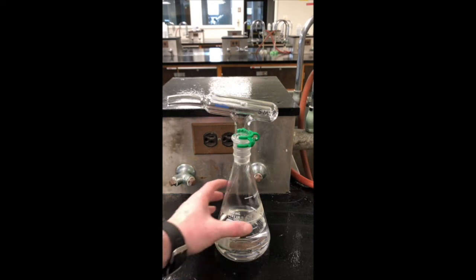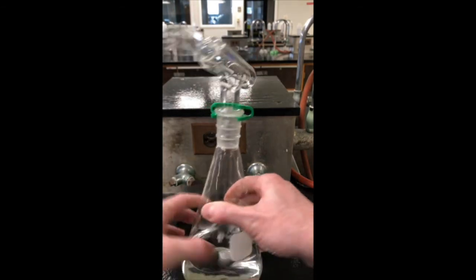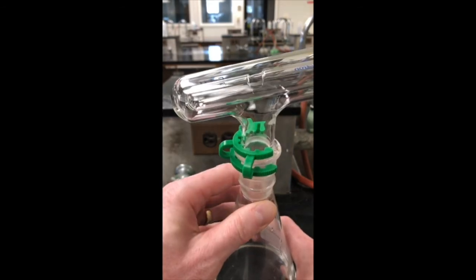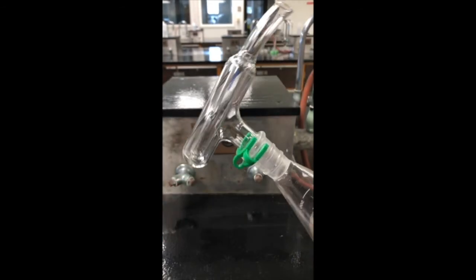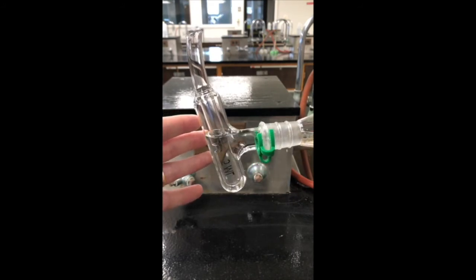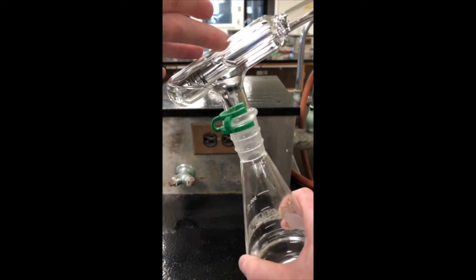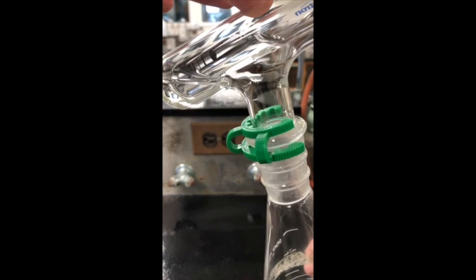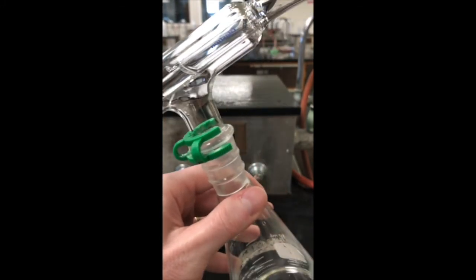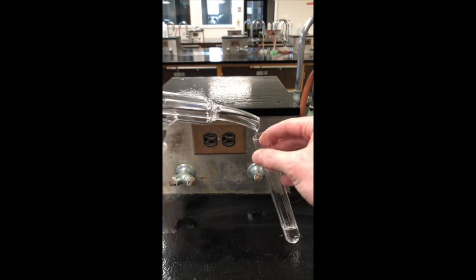It's a piece of glassware designed to dispense a set volume. This one dispenses 5.0 milliliters. It consists of an outer chamber and an inner chamber with a notch cut into it. You can tilt the dispenser so that solution fills the outer chamber, and if you tilt it far enough, the solution will start to pour into the inner chamber through the notch. The solution can't fill past the opening in the inner chamber, and once it's filled to the maximum amount possible, that amount is calibrated, in this case to 5.0 milliliters. You then tilt the dispenser in the other direction to dispense the solution.